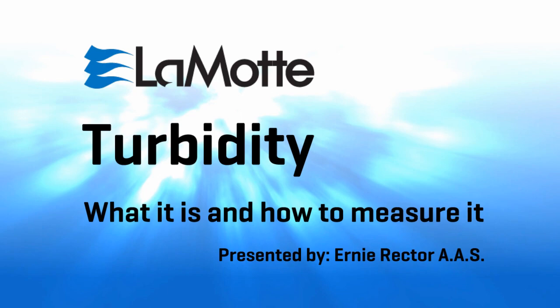Again, my name is Ernie Rector, and we're going to talk briefly today about turbidity, what it is, and some ways to measure it. I spent 24 years in the water wastewater industry before coming to LaMotte, so turbidity testing was a part of my everyday for a very long time.